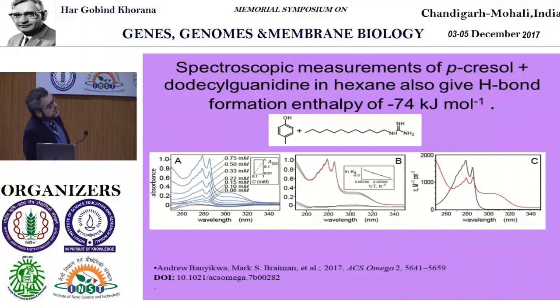And this is not purely a deprotonated cresol spectrum. This is actually still a mixture of both the proton transferred from the cresol to the guanidine and the other structure that I showed where the cresol retains the proton.